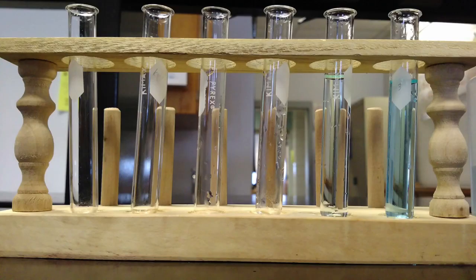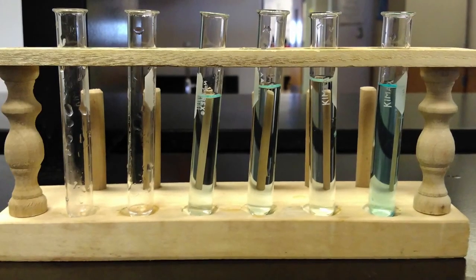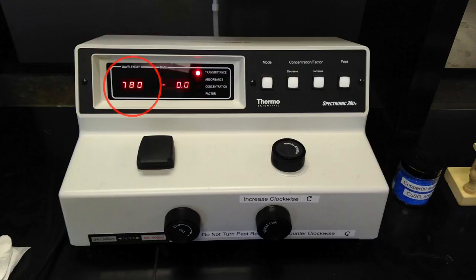Fill each of the 5 test tubes about 2 thirds of the way full with the 4 different solutions and the unknown solution. Turn on the spectrophotometer and set the wavelength to 780 nm.